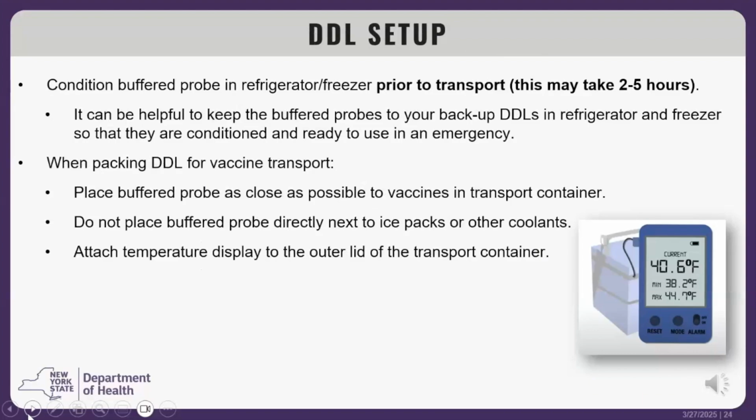When packing a DDL for vaccine transport, place the buffered probe as close as possible to the vaccines in the transport container. Do not place the probe directly next to ice packs or other coolants, and attach the temperature display to the outer lid of the transport container.